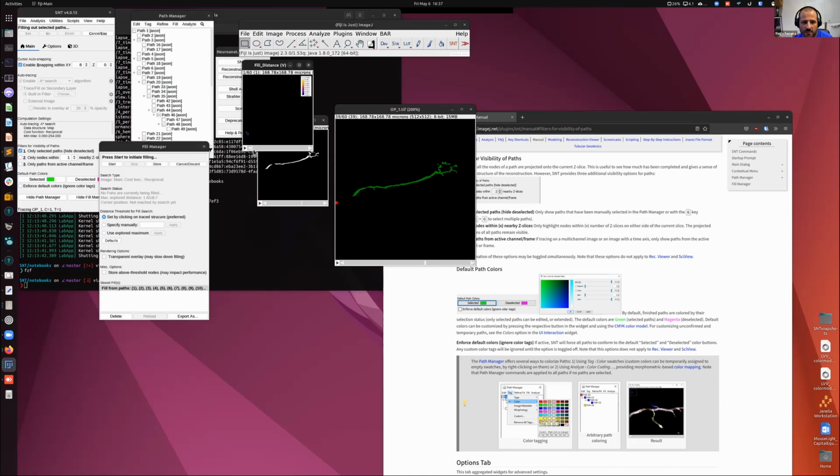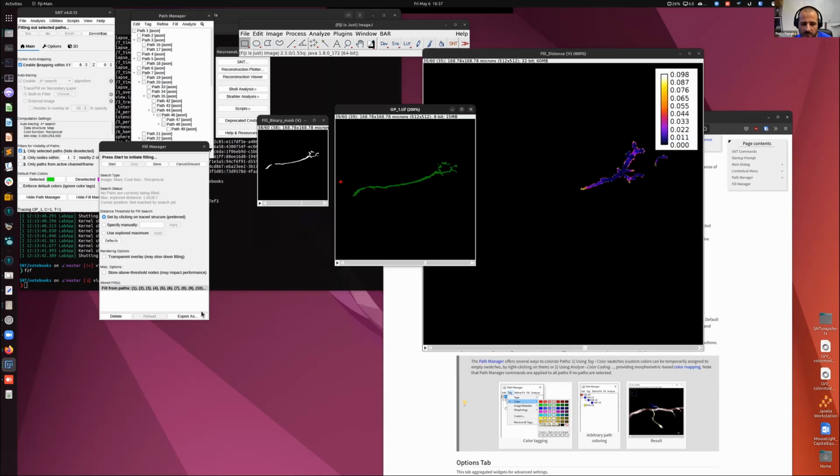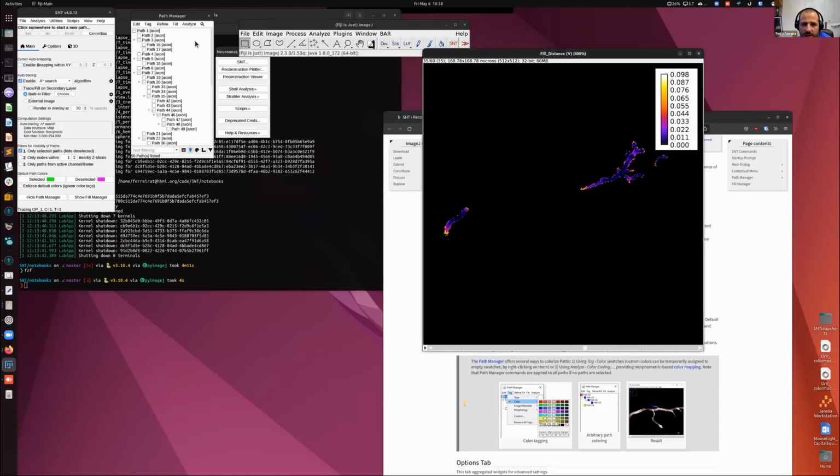So you now see those are different diameters. You can use this to mask out, for any sorts of image processing that you need, using these masks or using labels. Okay, so that's pretty much it. In this case, it's not very intuitive. Imagine you have a forest of neurons and you have a tertiary neuron, you could use these to mask out all the remaining cells. So in a nutshell, that's pretty much it in terms of tracing. Do you guys want to ask any questions about this?